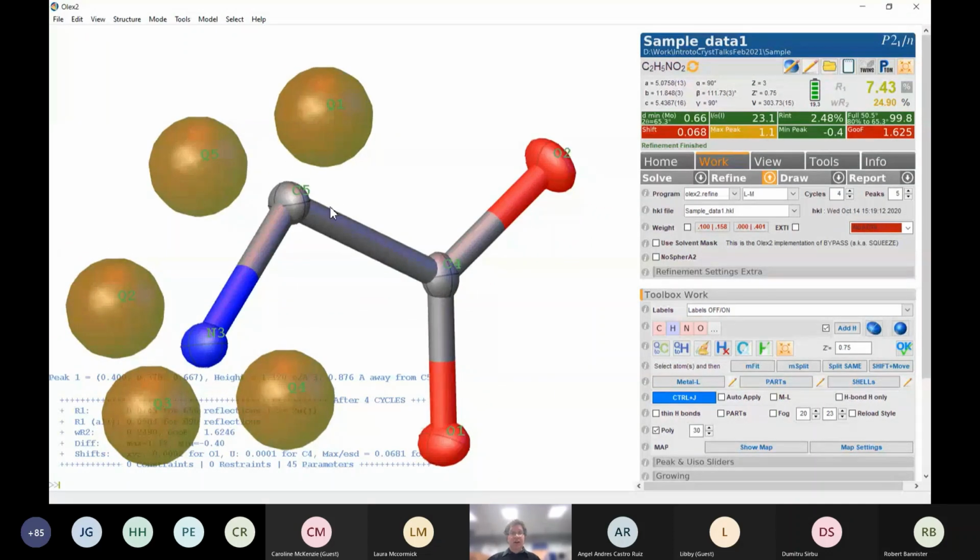In this case, this is an sp3 carbon. It's going to have 2 hydrogens on it. You can basically work out the angles. You've got the nitrogen-carbon angle, and you can say exactly where these 2 will be, equally distanced. And the same with the nitrogen here. You've got 3 around it, you can put in an angle and so on. Now, what we can do for that is this very simple add H atom.